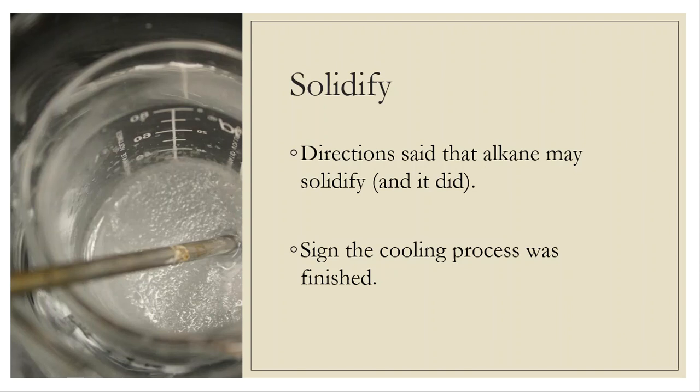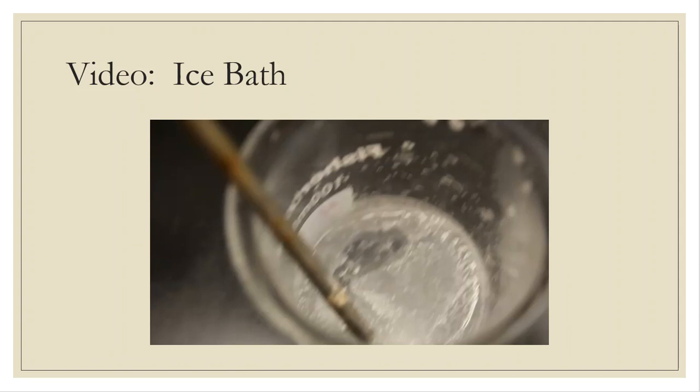So the directions tell me you could see a solid that gets formed. And I did. And this was a very good sign that I was toward the end of the cooling process at this point. So I felt really good about what I saw. This was not alarming by any means. So I'm just going to have to kind of take care of that in the separation stage. All right, so here's a video of the ice bath and toward the end of that process.